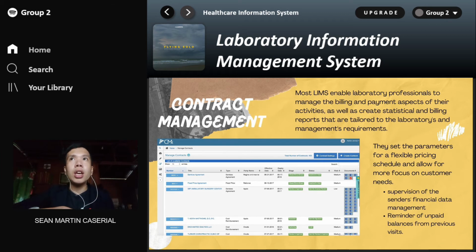For example, you are admitted in the hospital and then you haven't paid yet for your previous visit, so it will appear in the contract management. This contract management, the main idea here is to maximize the procedure while reducing the cost.